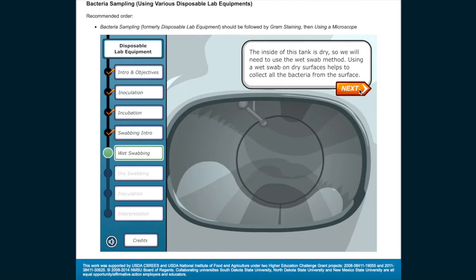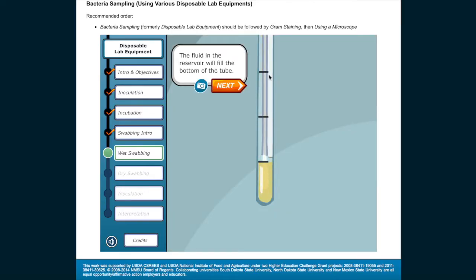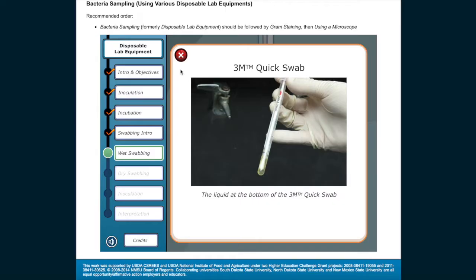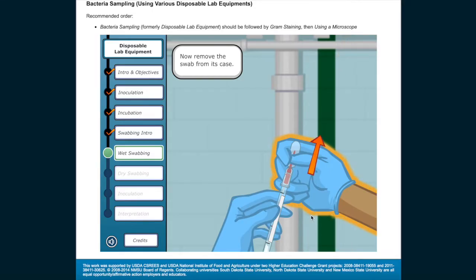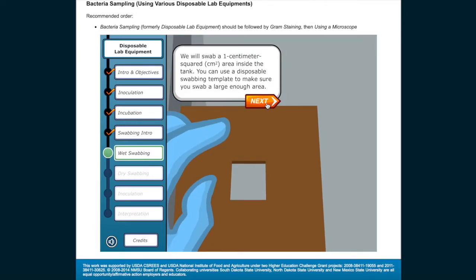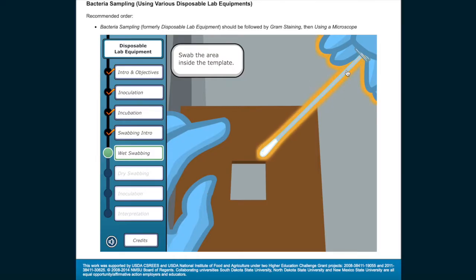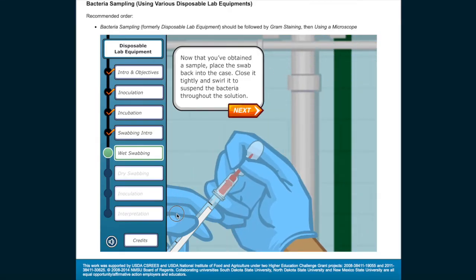The inside of this tank is dry, so we will need to use the wet swab method. Using a wet swab on dry surfaces helps to collect all the bacteria from the surface. Start by breaking the reservoir on the 3M quick swab — the fluid in the reservoir will fill the bottom of the tube. Swish the swab around to make sure the cotton tip is wet. Now remove the swab from its case. We will swab a 1 cm squared area inside the tank using a disposable swabbing template. Swab the area inside the template, then place the swab back into the case, close it tightly, and swirl it to suspend the bacteria throughout the solution.